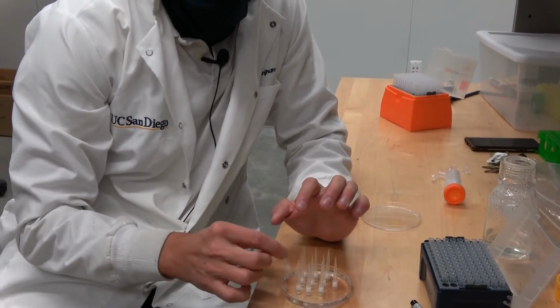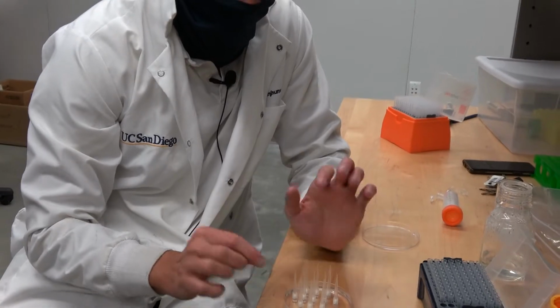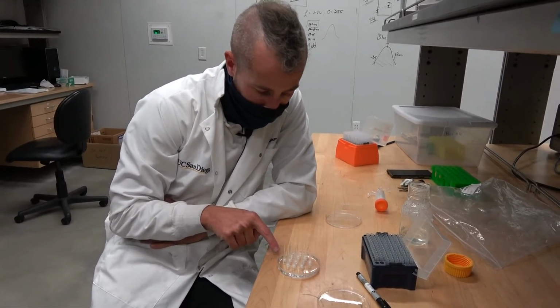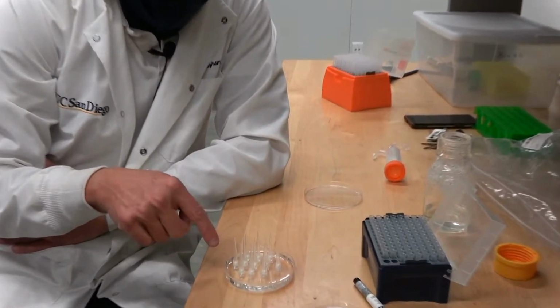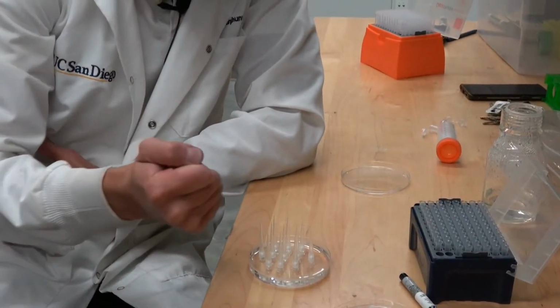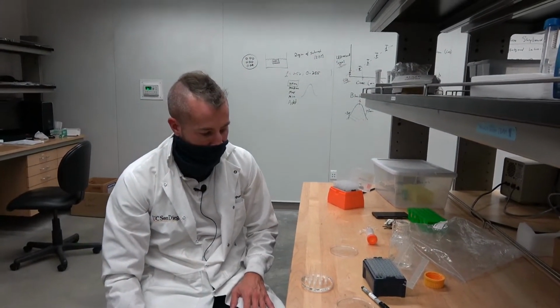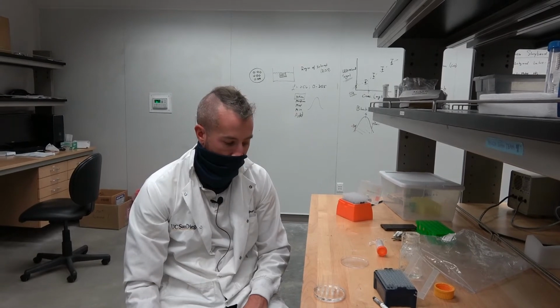The hardest part about this is not getting them to do static electricity with each other. There's not a lot you could mess up. You don't want them super close to the edge, just because it's going to be harder to image. But this looks pretty good. So if we let this cool for a minute, you'll see how the agar looks when this is done.